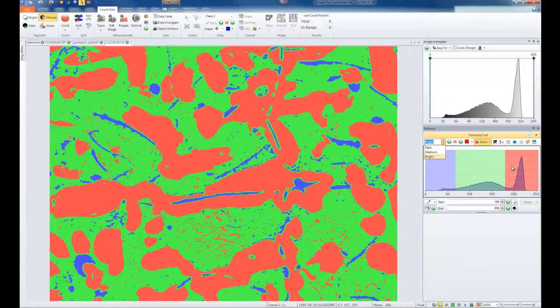If I wanted these segmentations to ever overlap, I have the option to do so with Allow Overlap. Right now, without this checked, there is no overlap allowed. If I didn't want to simply drag my selection, I could always use the eyedropper tool with a specific size of selection. 1x1, 3x3, or 7x7 gives me different selection sizes which picks either less or more pixels to sample from. By simply selecting my eyedropper, I get a tool that will display all of the intensities under my mouse.